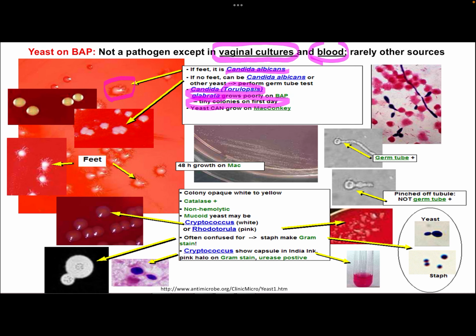And take note of this one. Gram-positive cocci or gram-positive bacteria grow on BAP, on chocolate, but not on MAC, right? Gram-negative bacteria, on the other hand, can grow on BAP, can grow on chocolate agar plate, and they can grow also in MacConkey.